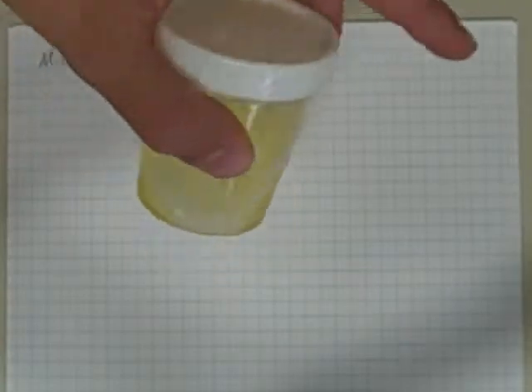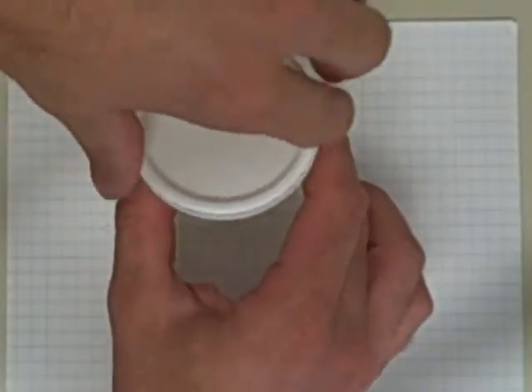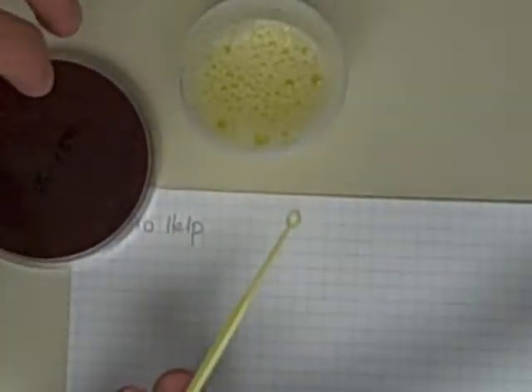So here's a little bit of micro help just to clarify what was going on. The idea behind the micro stuff is to take urine, which obviously isn't real because I just want to show you demonstration purposes here. But pretending this were real urine, we have these plates that we can use to streak out these cultures.